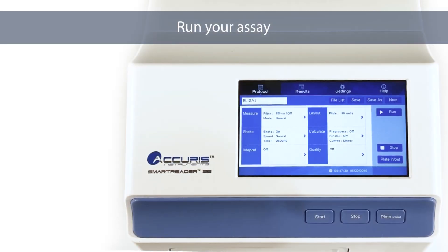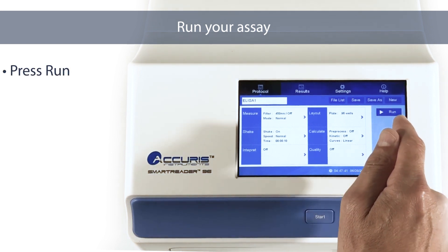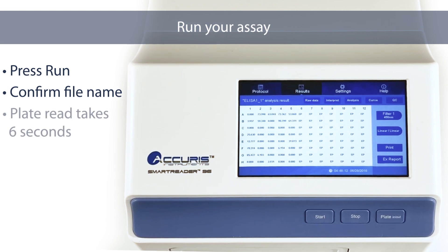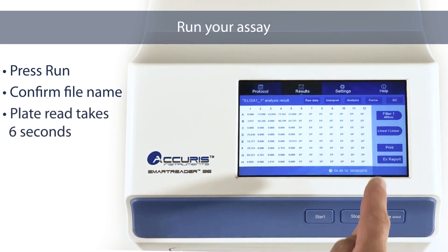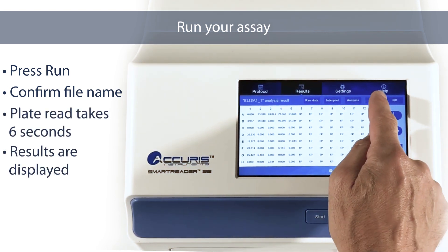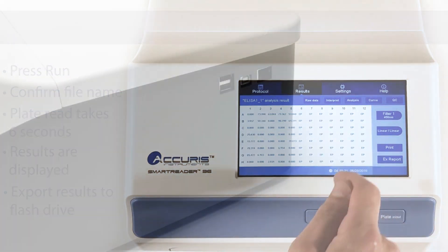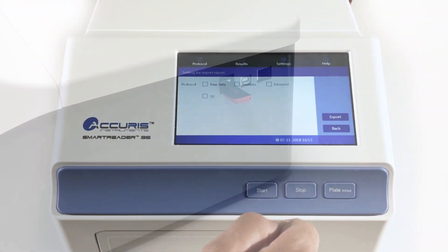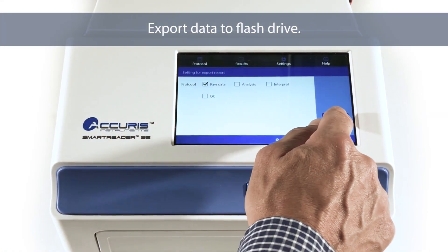Running an Assay. Press the Run button on the main protocol screen and confirm the file name. The absorption readings are completed in about six seconds and the results are displayed. To save data externally or to transfer to a computer, insert a USB flash drive into the side port. Select the data to be transferred and press Export.